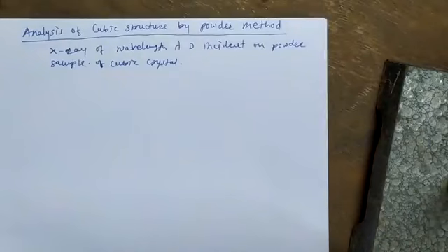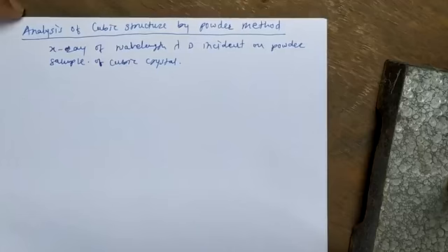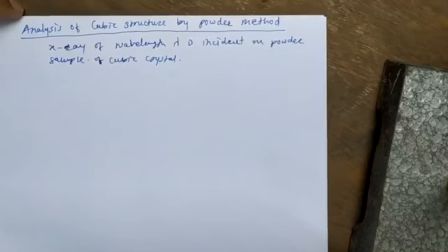We are going to see here how to analyze that cubic crystal structure of that powder sample.